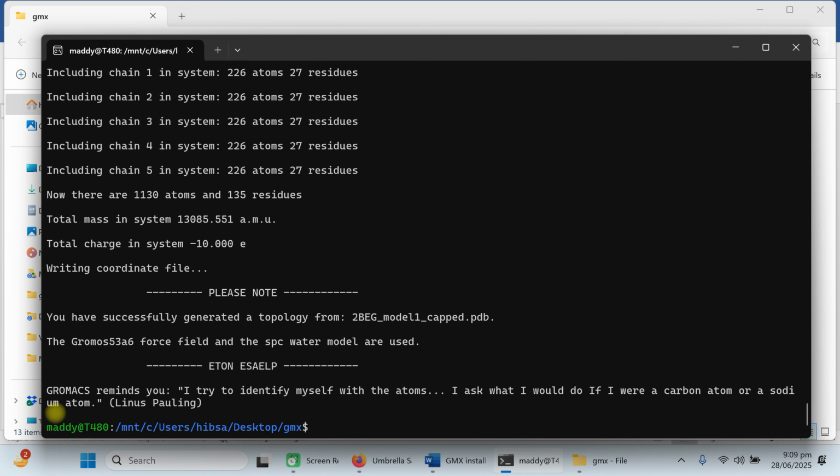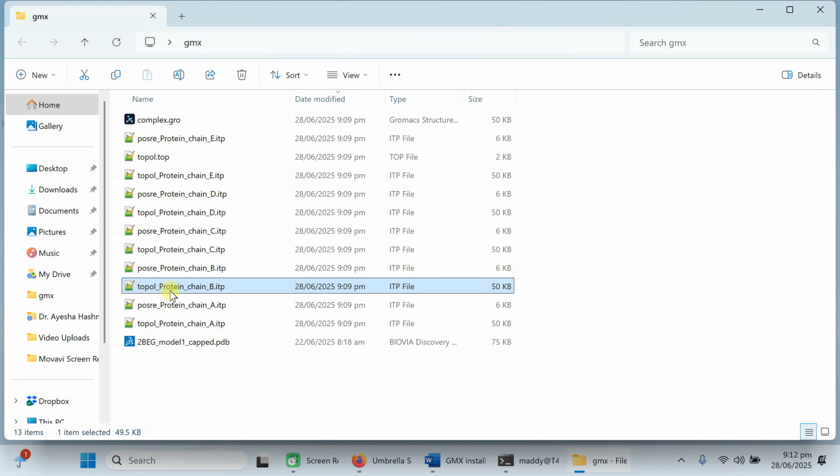You can see your own protein. If your protein contains the first amino acid as amine, you can choose amine. If your first contains NH2, you can choose NH2. If there is some other acetyl or amine or something more, you can choose none. And for the terminal end, you need to choose the carboxyl group or the other group as per your protein. So you need to choose wisely. Our job is completed. Now if you go to the folder, you can see multiple files have been generated.